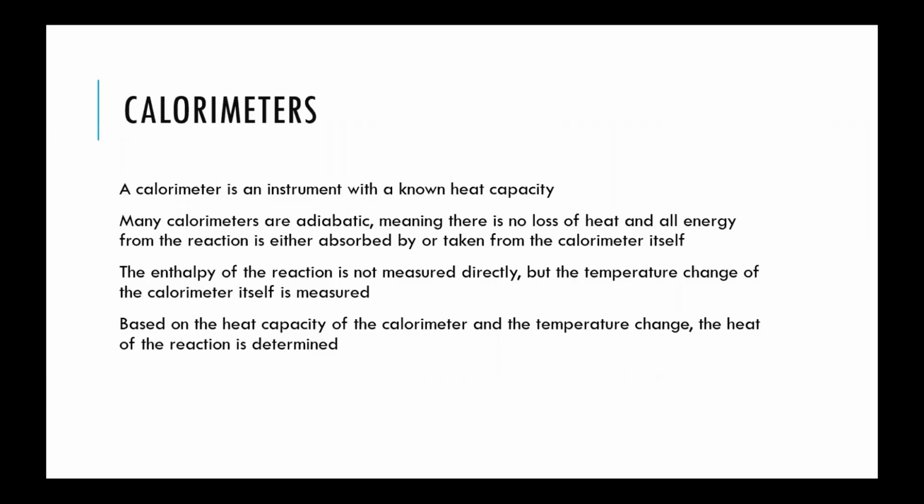Adiabatic is a theoretical term for that, but for the most part, all of the energy is contained. The reason for that is a lot of it will be absorbed by the calorimeter itself.